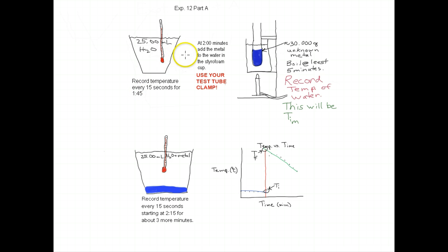You're going to be working with a partner, and you'll have to work together to do this. At exactly the two minute mark, the test tube should already be just taken out of the water. Use a test tube clamp, it's going to be hot, and add the metal. Dump it right into this 25 milliliters of water.